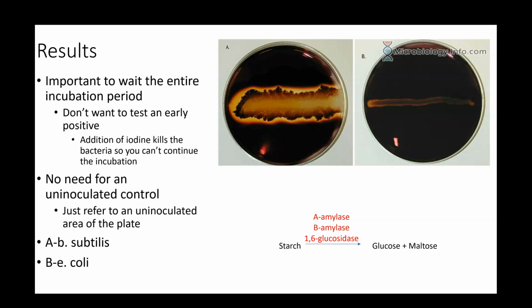But the problem with the starch test is, of course, in order to read it, you have to add that iodine, and iodine's going to kill. If it's negative, you can't just put it back in the incubator and continue the incubation time because you killed your bacteria. So you really want to wait the entire incubation period to analyze the bacterial samples when you're doing the starch test, because as soon as you add the iodine, you're basically going to throw these guys in the biohazard bag because they're dead.